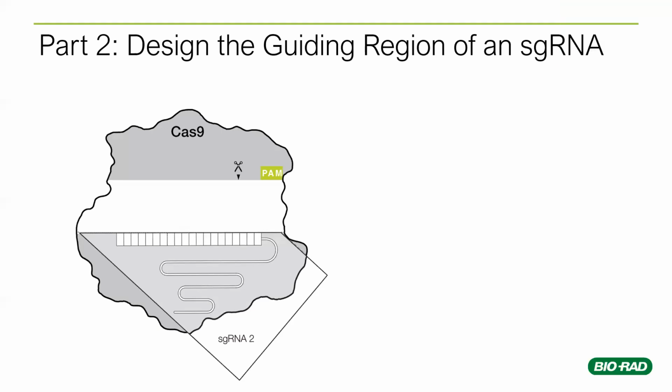So Leigh, hi. Yes. I just want to make sure there's clarification for the last 2 items that were dropped in the chat prior to moving. So there's one question: could the strip be fed the other way? Absolutely. And you won't get a match with this particular one. We've set it up so that they won't get a match if they feed it in the other way. Hopefully that makes sense. And the sequence on the single guide RNA 1 would be complementary to the DNA sequence you are searching for. So that's what's in the chat. That's right, exactly.